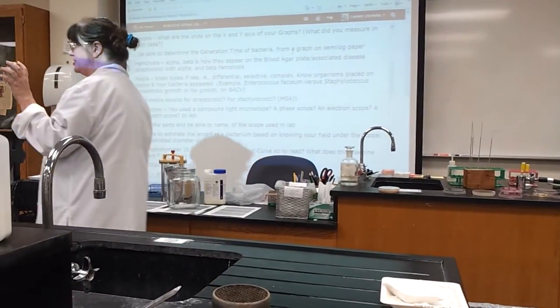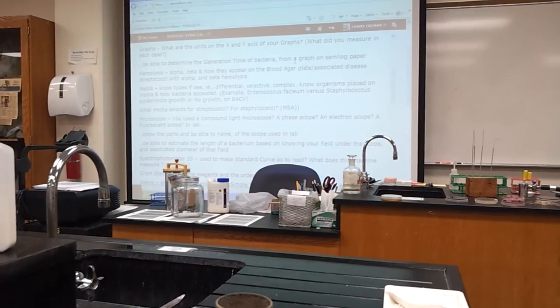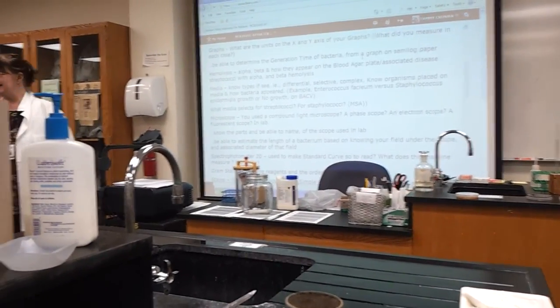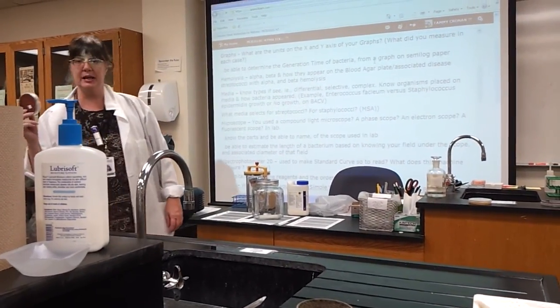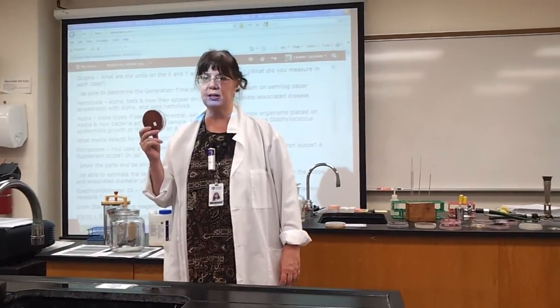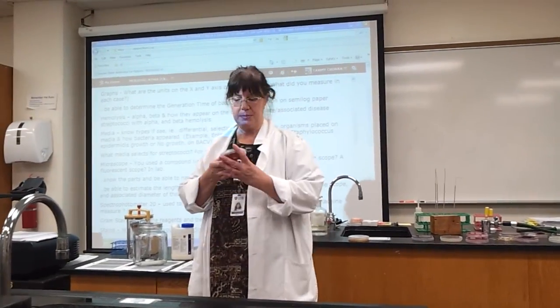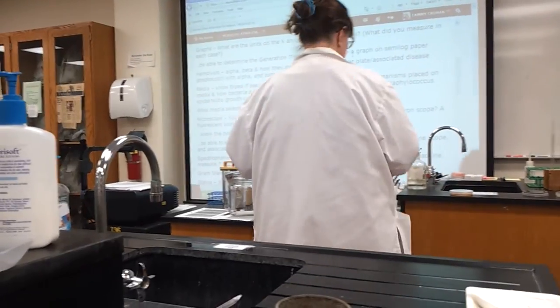Chocolate agar. Chocolate agar is what? It's blood agar that's been heated up. We're heating it up so the enzymes will not break down growth factors needed for, here we go again, fastidious organisms. Some of these could be strep, but we were doing the what test on this?